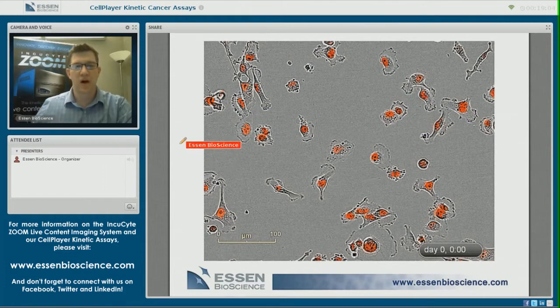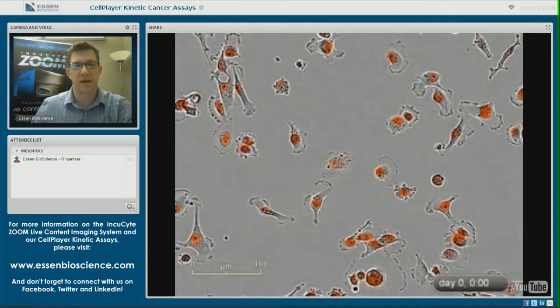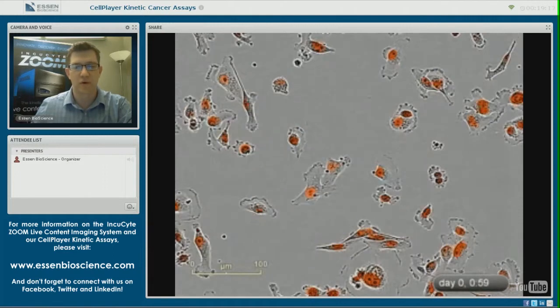This first video includes MDA-MB-231 breast cancer cells that have been labeled with the Nuclight Red reagent. Again, you can control the resolution of these videos using the drop-down in the bottom right corner of the screen.